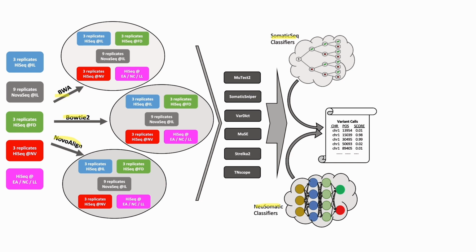Initial confidence levels were assigned based on each mutation call's reproducibility across different aligners, different sequencing centers, and different sequencing replicates. In short, the high confidence mutations have support in the majority of the sequencing replicates, the majority of the sequencing centers, and the majority of the aligners. However, low VAF somatic mutations will not be highly reproducible due to sampling.